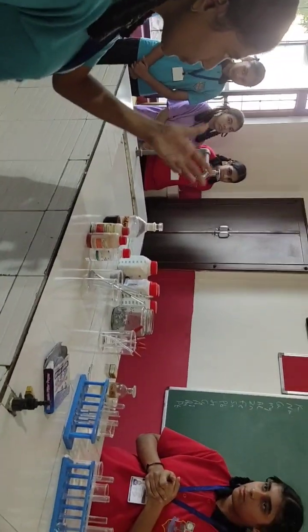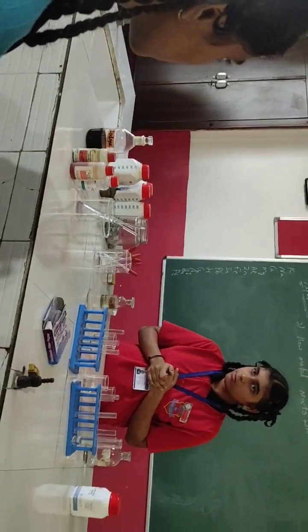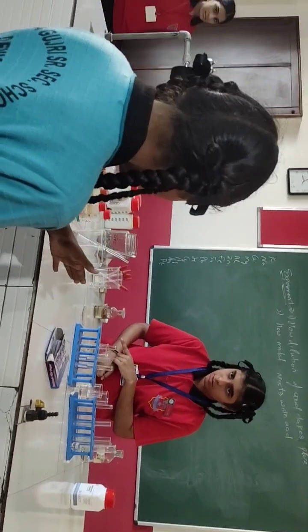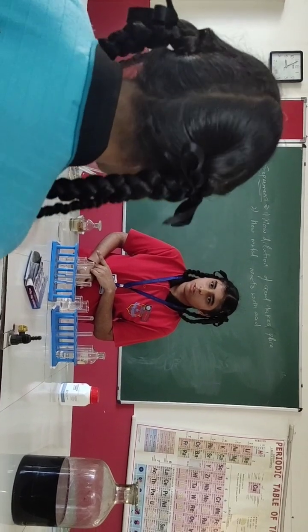If we use concentrated HCl in that, it can form hydrogen gas, and the evolution of hydrogen there can cause a blast. Please pardon. If we put concentrated HCl into that, there will be evolution of hydrogen gas. Can it blast?